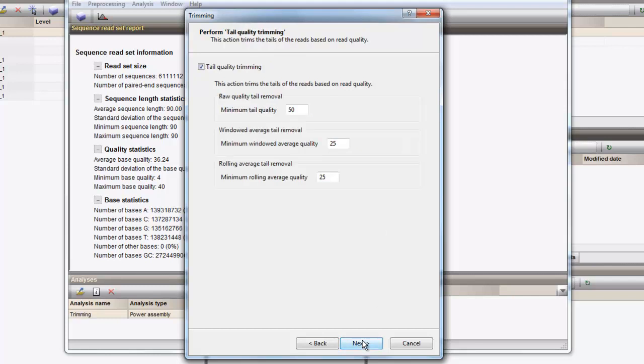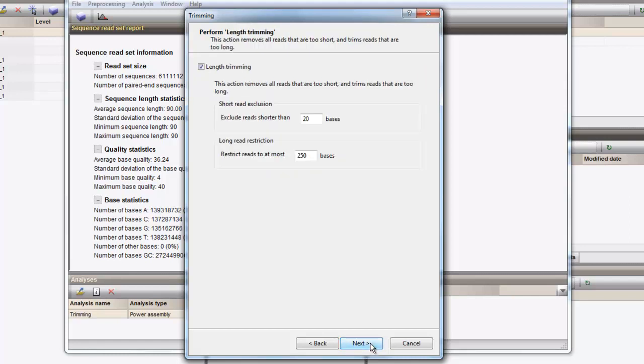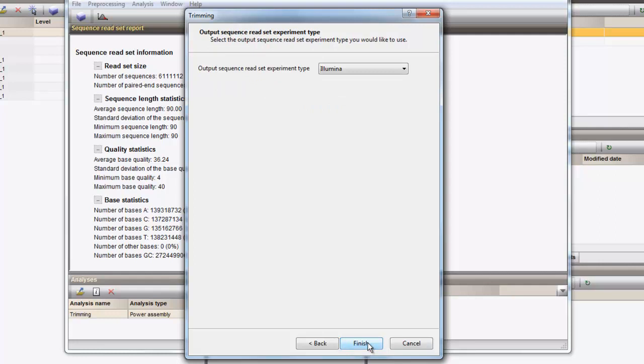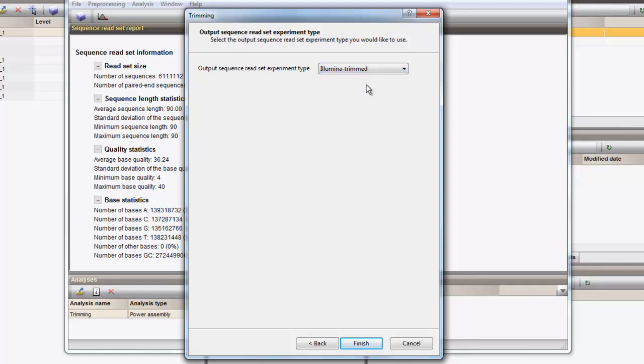In the next page, we alter the settings to 15, 25, and 20 respectively. We exclude all reads shorter than 50 base pairs, and select the sequenced readset experiment type Illumina Trimmed to export the trimmed dataset too.